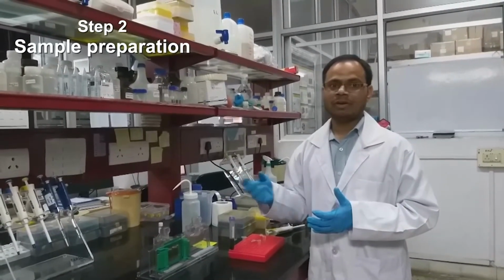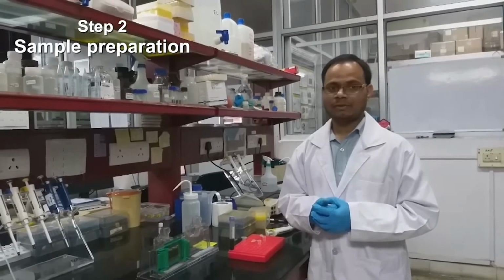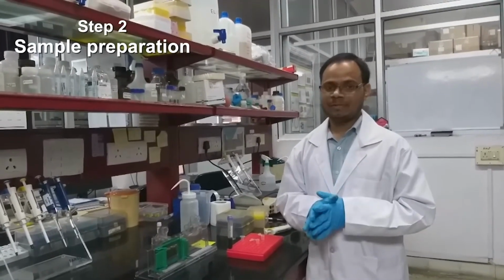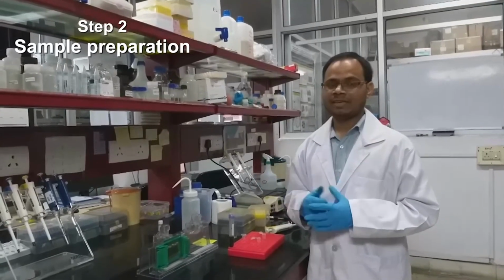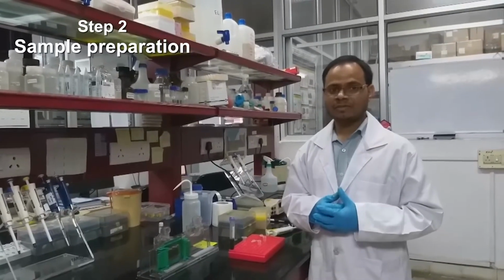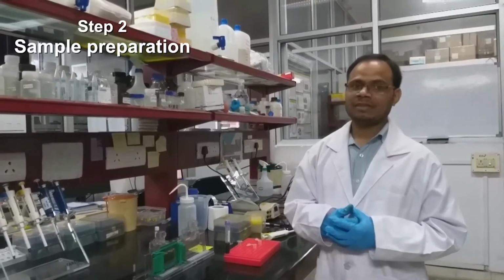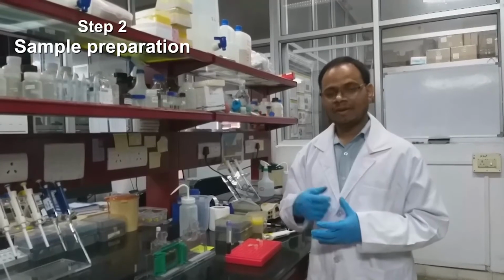You can see only a 20 kDa band corresponding to that protein, because DTT breaks down the disulfide bond and you can see only a single band. If you want to see the actual molecular weight, you have to run it on native PAGE where there is no reducing agent or no detergent.